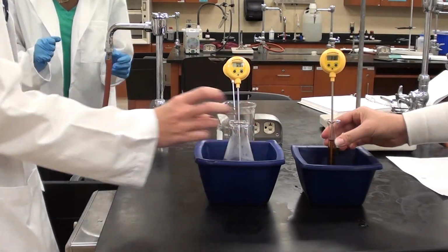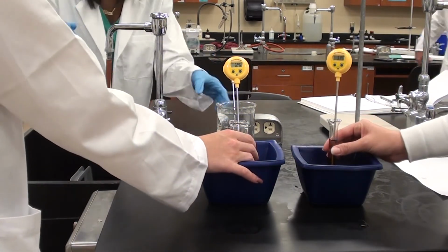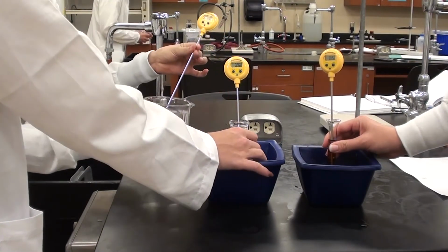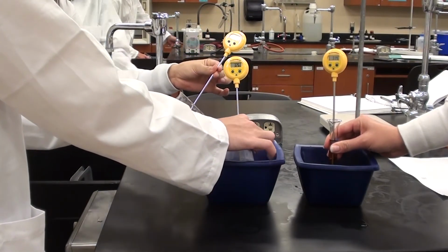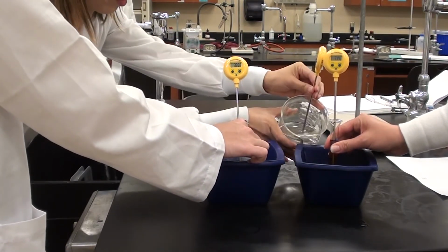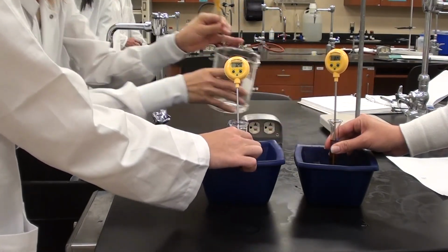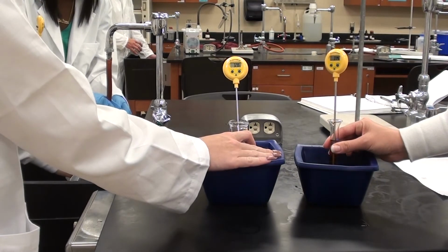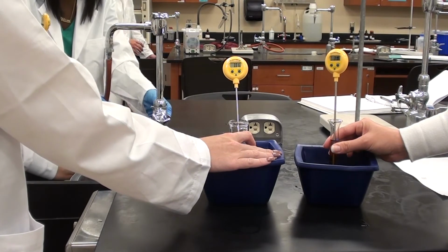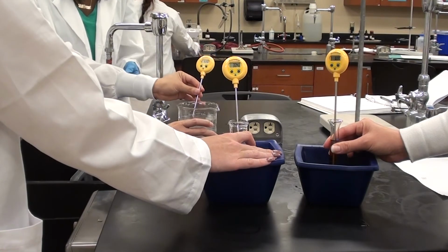Okay, good. And now you'll have to hold on to them while we add hot water to the baths here. The hot water here is at around about 44 degrees. So yeah, just fill it up about halfway for each, please. And what this should do is now be enough to raise the temperature of these solutions here. Now the water was around about 45 degrees, so I'm hoping that'll be sufficient to get these up to around 40 degrees.